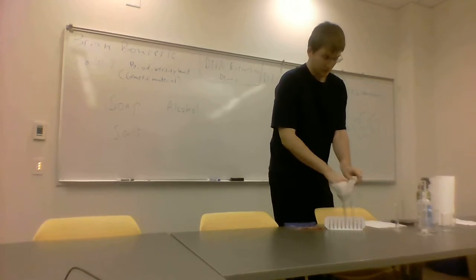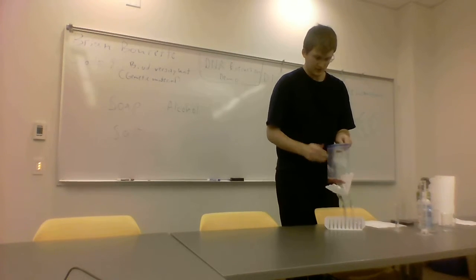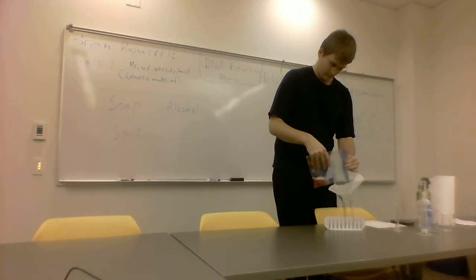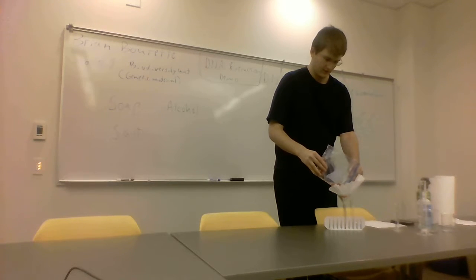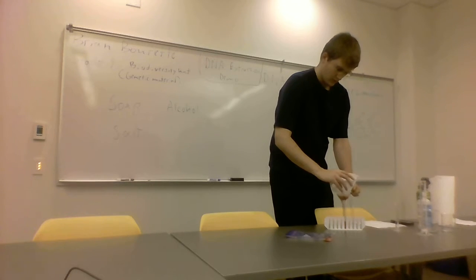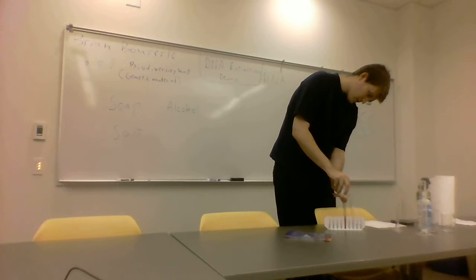And then while we're waiting for that to drain, I got some more questions for everyone. I just love questions, and this thing does not want to stay in. And this is why we're going to end up doing this in pairs later, so that you have a helping hand when you go to pour all your material in here. Also help it along a little. Just make sure not to rip your filter paper. Would not be good.